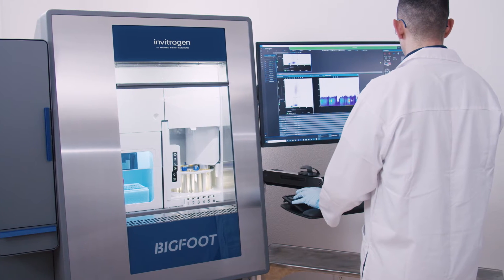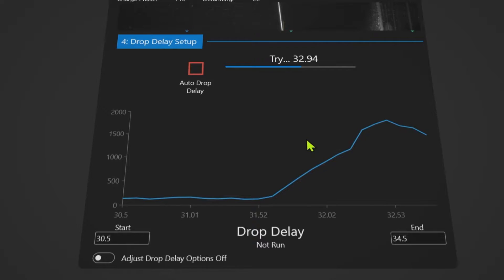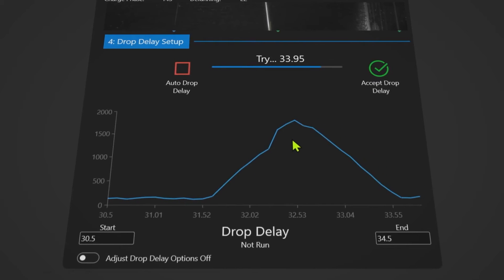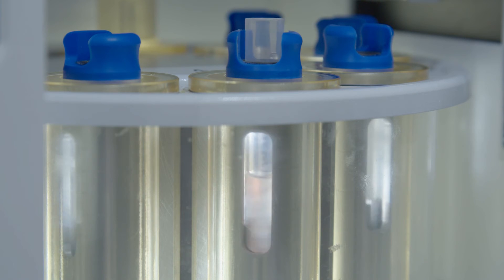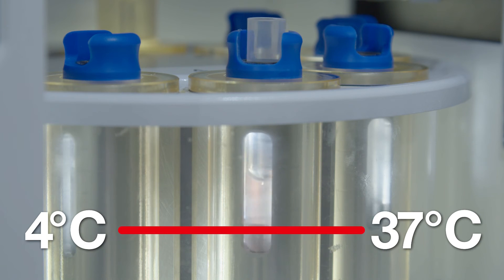To streamline workflow and reduce user errors, automated stream calibration and drop-delay simplify sort setup, while clog and end-of-sample detection notifies the operator and stops the sort to preserve precious samples. Integrated temperature control and agitation maintain sample integrity for sample input, while temperature control of the output maintains the viability of sorted samples.